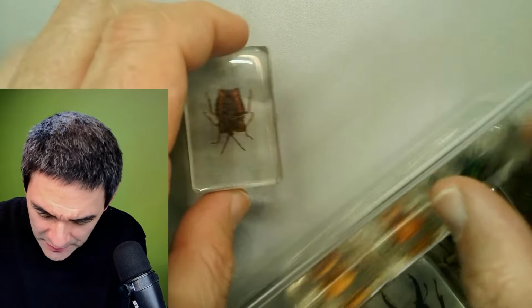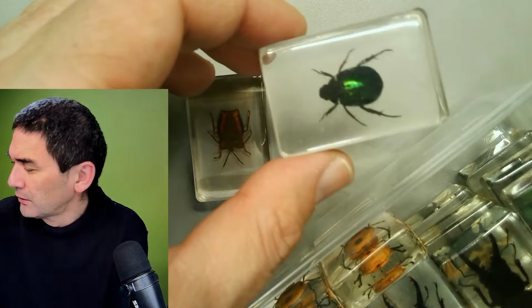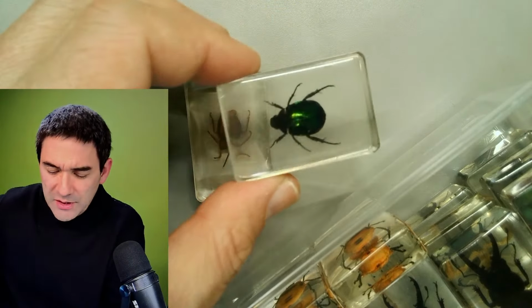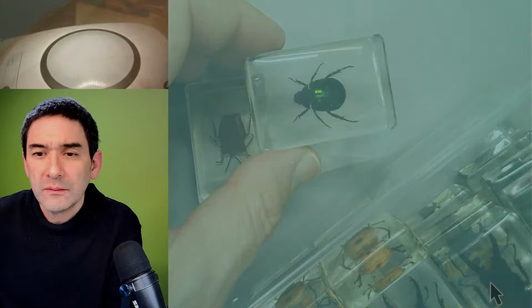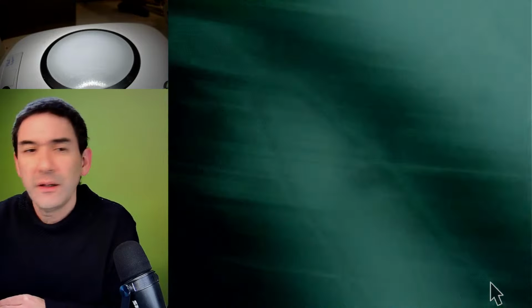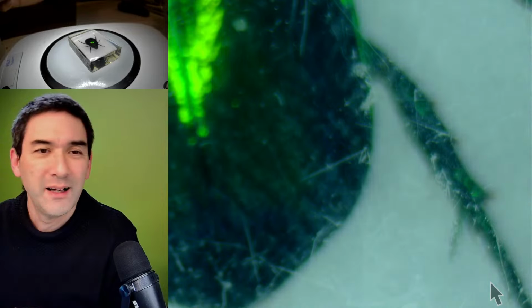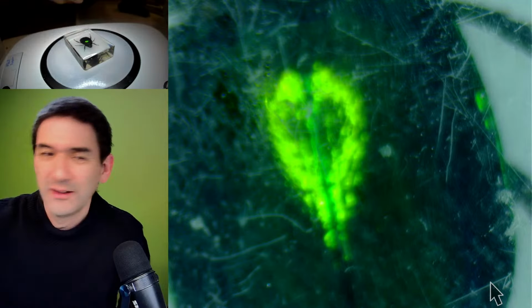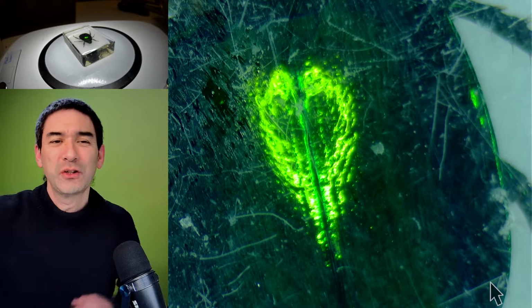There was actually one, a green one, which, no, this one is metallic green. We can have a look at this one here, to see how it actually looks. Look, it's a reflection. Interesting. It's a heart. Do you actually see? Yeah, it looks almost like a heart.